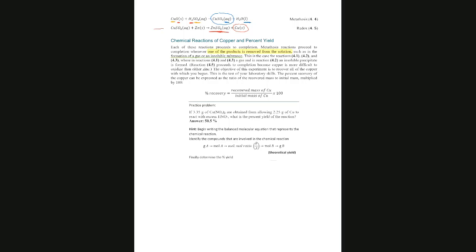And we observe bubbles of hydrogen gas because there is a side reaction: basically the zinc that you add not only reacts with the copper sulfate, but reacts with the acid to form, let's say, hydrogen gas plus zinc plus 2.